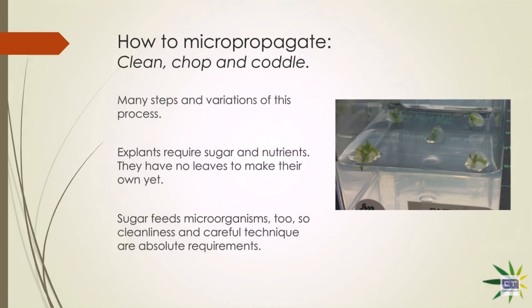Well, this leads into a great question from someone who's asking, how long can cannabis stock be stored in tissue culture without degradation? I think this kind of leads into this. Well, that's a question that comes up a lot, and I'm assuming that the questioner, please chime in if I'm misinterpreting your question, means genetic degradation. I guess that can be looked at in two ways. Yes, one, genetic degradation, but two, could the plant actually degrade, like fully decompose, I guess, is the word I would probably use.